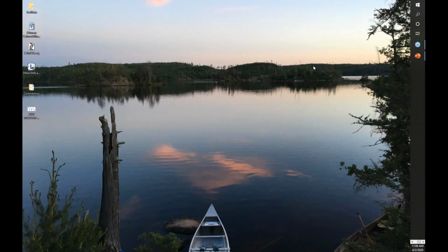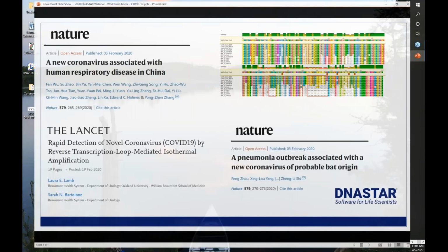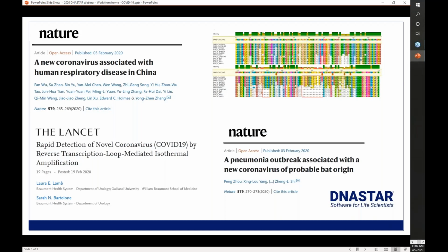It's actually amazing to see the number of researchers and the research that is still going on in the world today. So to highlight, we are in the middle of the coronavirus research. We have a number of researchers who are actively developing, studying, and researching with the software. So here's just to highlight some of those publications recently this year of people who have used our solutions.